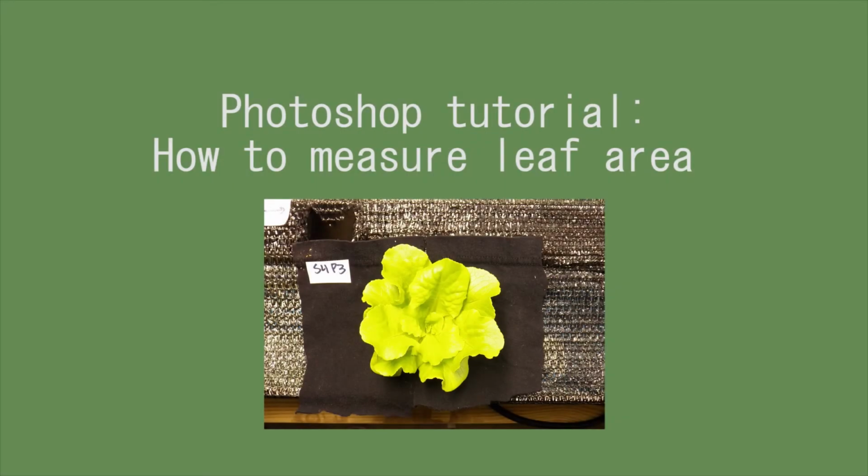Hello everyone! Today I will be showing you how to measure leaf area using Photoshop. This is an inexpensive and non-destructive method of estimating leaf area.